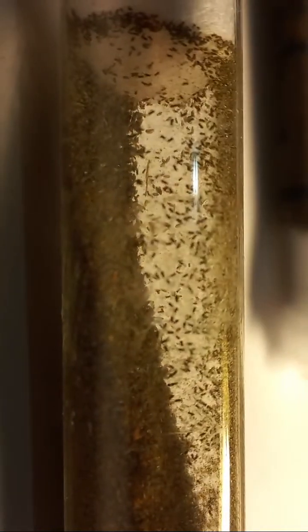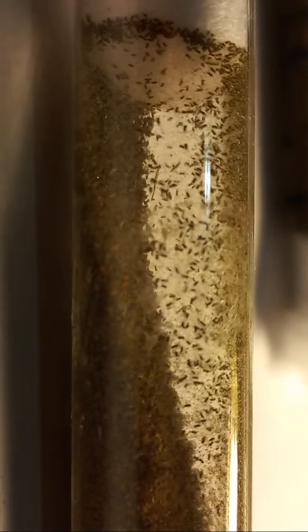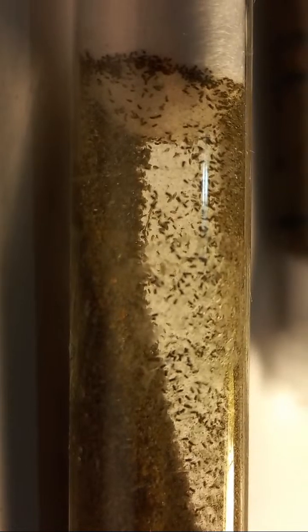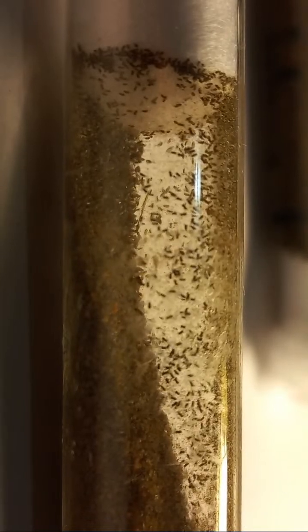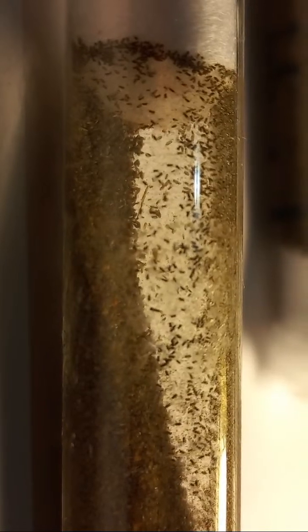These are tiny egg parasitoids of moths. These are Trichogramma parasitic wasps. Why are they so tiny? Because they are parasitoids of eggs, and eggs of insects are very small. They have a size of just half a millimeter. Yes, 0.5 millimeter size. They are sitting here in mass number.